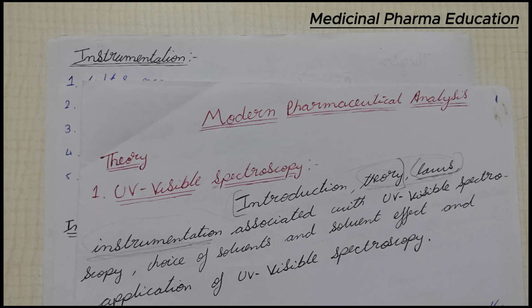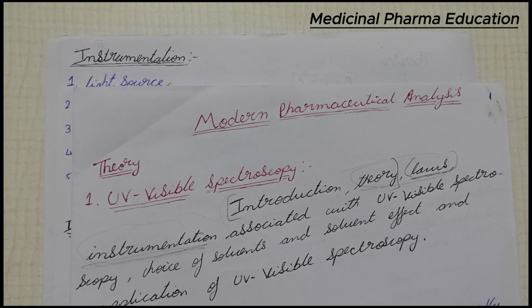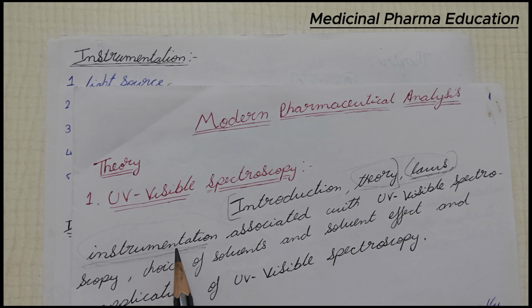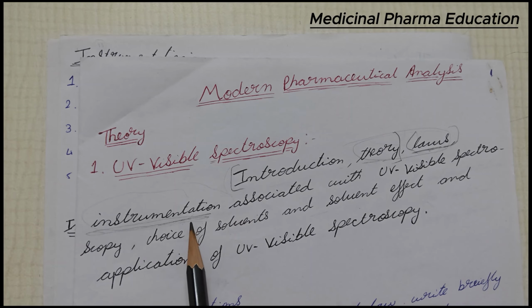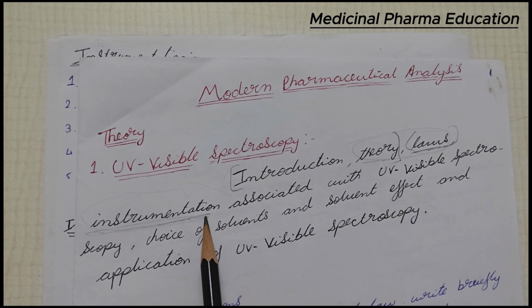As you know, this instrumentation is very important because the parts, for example the detectors or the monochromators or the source of radiation, are used in other instrumentation also. So this instrumentation becomes a very important topic for your learning.